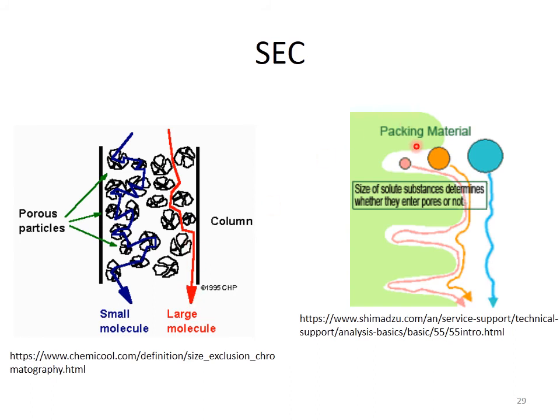This is also represented in this part of the illustration. So we see that this green colored thing is the stationary phase, and we have proteins of 3 different sizes here.